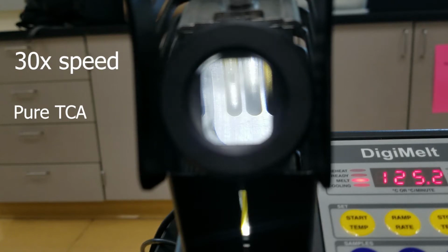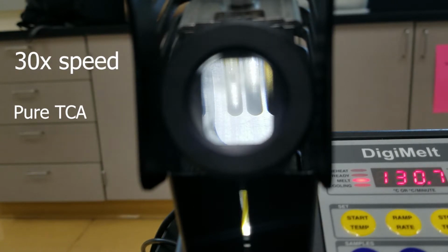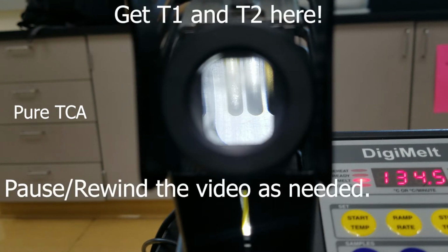Depending on if you overpack your solid or not, you may have only the bottom portion that will melt, for example. So if you pack, say, 2 inches worth of height in there, chances are only the bottom portion is going to melt. So don't wait until the whole thing is going to melt, because it won't do that. All right, you guys catch that? It looks like we're fully melted now.